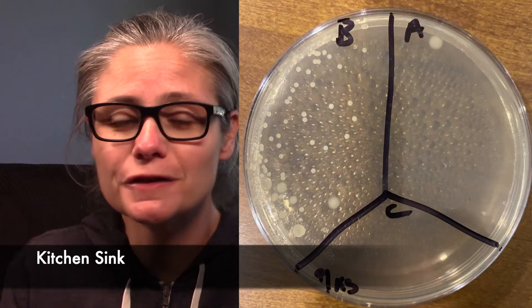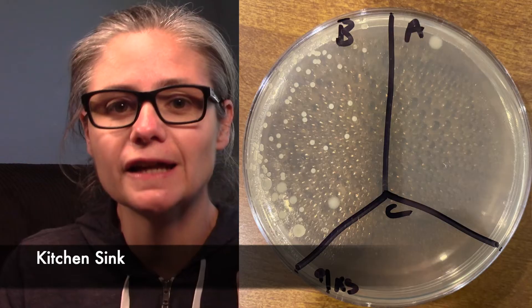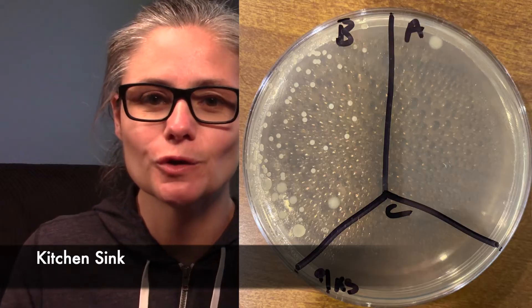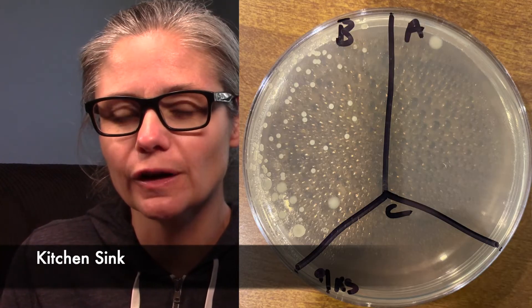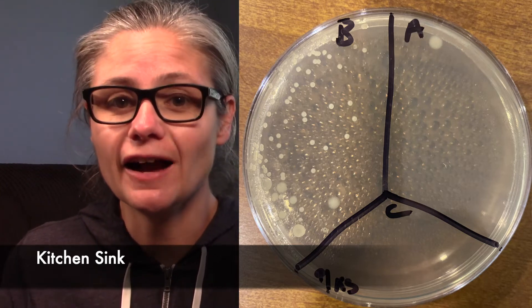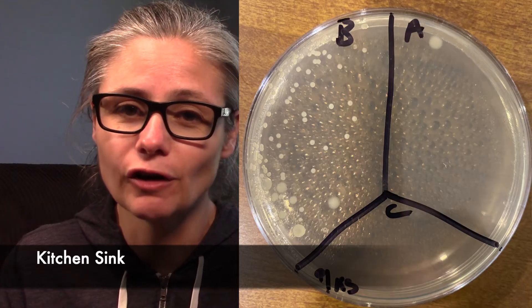The kitchen sink. Again, the before section has some bacteria — I'm not getting quite as much as I normally get in my kitchen sink swabs, because my dishwasher broke, so I'm doing a lot of hand washing and the sink is getting hit with a lot more hot soapy water. But you can definitely see bacteria in the before section. In the after section, we have one, maybe two tiny colonies of bacteria growing. So again, the 91% isopropyl alcohol does an excellent job at disinfecting my kitchen sink.